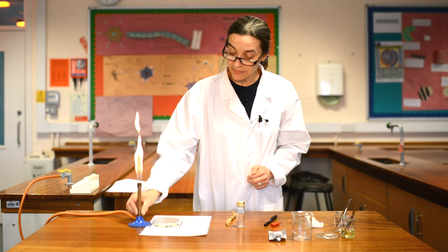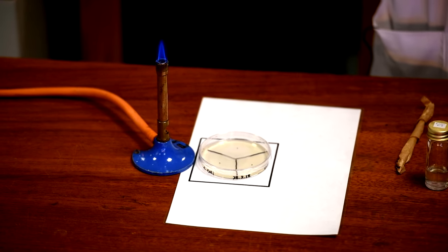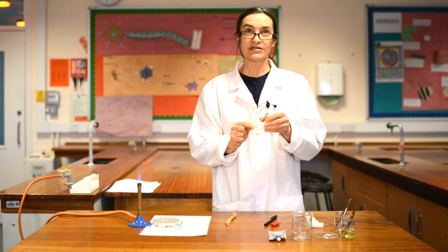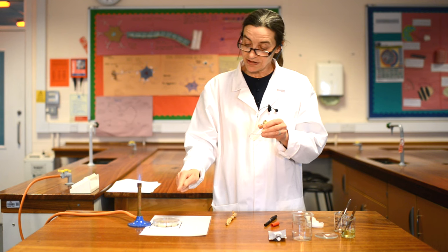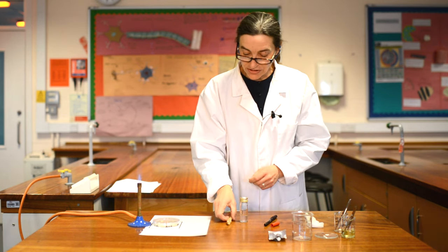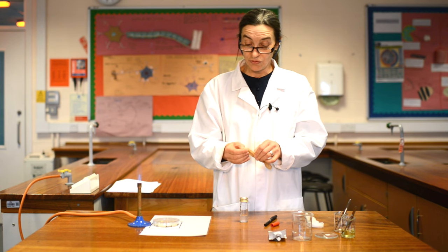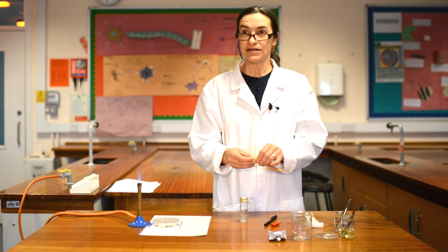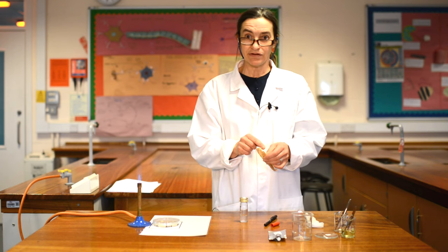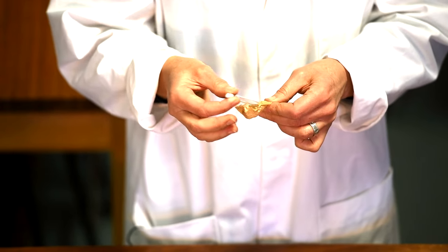To create that lovely sterile environment, we're going to turn the Bunsen burner to blue flame. You have never been allowed to be anywhere near that blue flame — you have always been warned that it is a dangerous flame. This is now creating the sterile environment that we need. This bottle contains a small sample of the bacteria that we're going to grow, and we need to get it out of here onto the plate without any contamination. This is a sterile pipette, sterilised by being wrapped in greaseproof paper and heated in an oven. It's sterile inside and out.